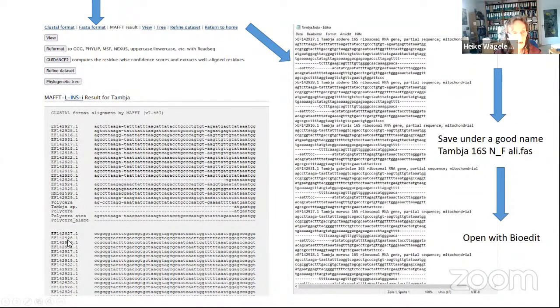And you see here that this is one specimen, and this is the sequence coming below. It does not end here, it starts again here, and it will go on until it is finished. So it's not that we have different specimens here. This is actually a block that is repeated down here.